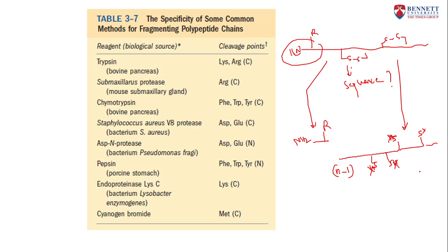Now you cannot really identify this directly. You can run a gel to identify its size, but that would not tell you what protein is present. So you have to identify it by breaking it down into small peptides, then identifying each of these peptides so that you can reconstruct the original construct. I'll stop here, and from here we'll start the next class.